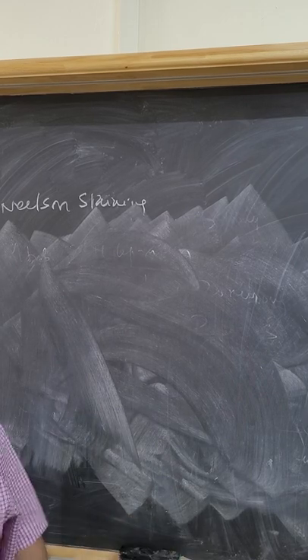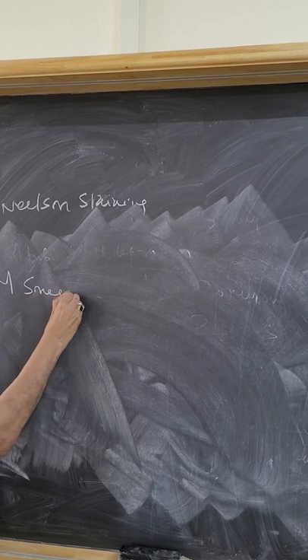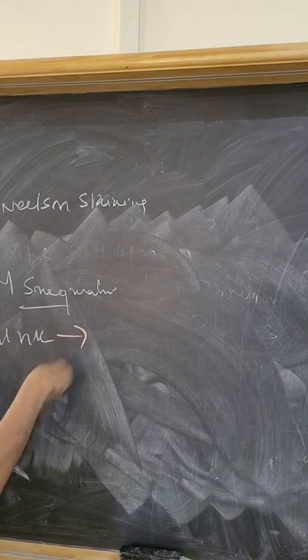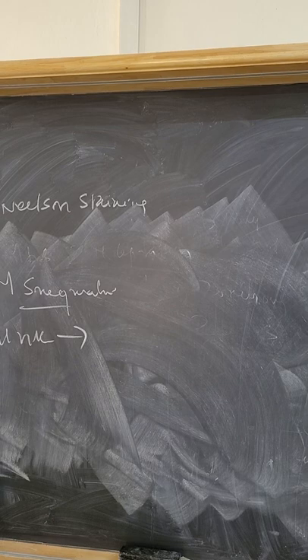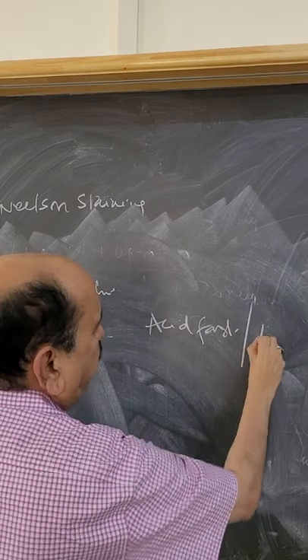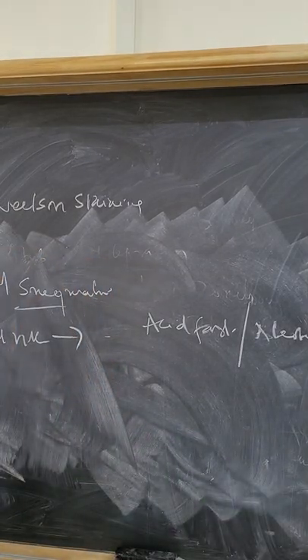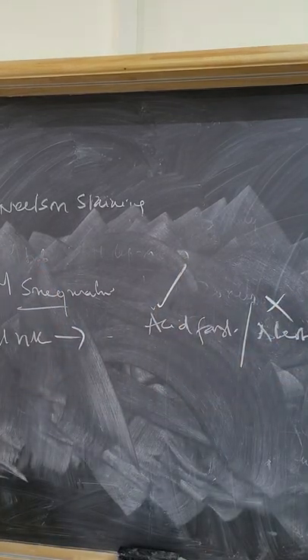Now, next question they ask is LJ media cultivation of tuberculosis. And there are some organisms which are called commensals. There is Mycobacterium smegmatis. For example, in the urine, if you see tubercle bacilli, how to differentiate between Mycobacterium tuberculosis and Mycobacterium smegmatis? Smegmatis is a tubercle bacillus present in the smegma. Mycobacterium tuberculosis is both acid fast and alcohol fast. But Mycobacterium smegmatis is only acid fast, not alcohol fast.